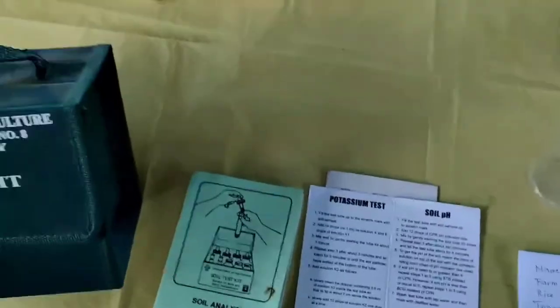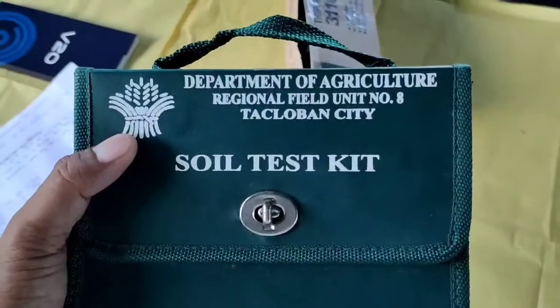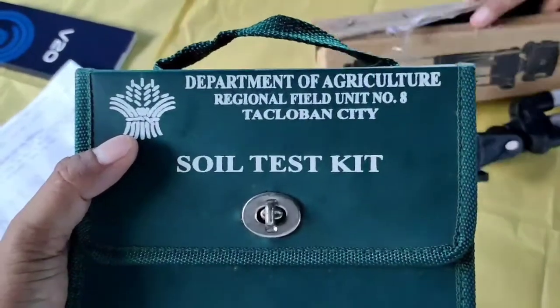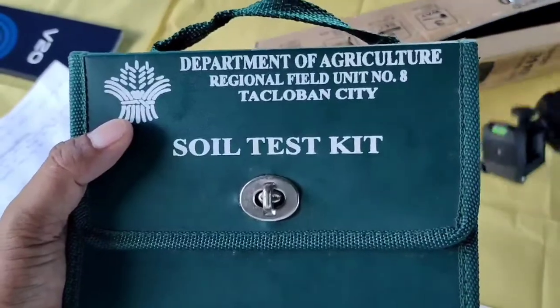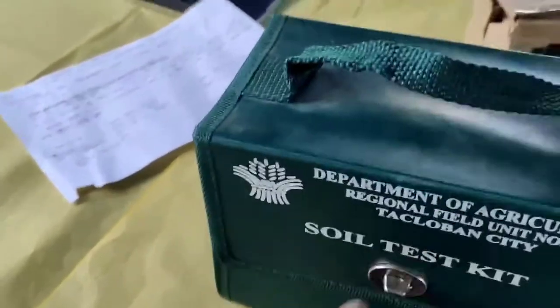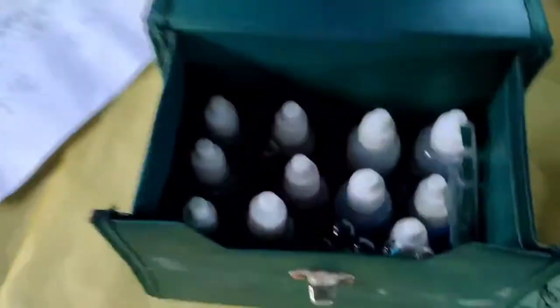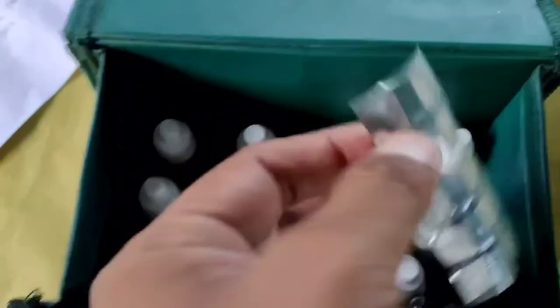Guys, ito pala yung ginagamit nating soil test kit galing sa Department of Agriculture Regional Field Office Unit No. 8, Tacloban City. Dito, may laman itong mga solusyon. Ito na yung mga solusyon natin. Marami dyan. May test tube, may thin foil.